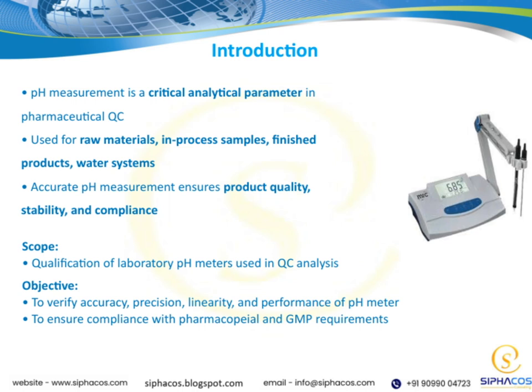Our objective is not just about testing the equipment. It's also about making sure we stay compliant with pharmacopoeial standards and good manufacturing practices, or GMP. These are critical to maintaining the integrity of our quality systems.